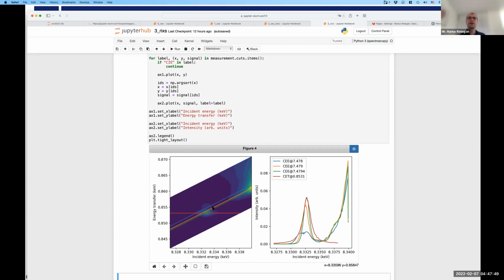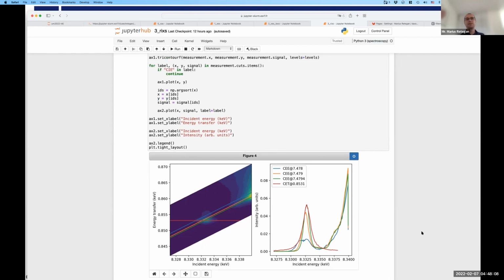If you measure a single cut and you see a spectrum like the blue one, you can come to a conclusion that this corresponds to a change in oxidation state, or an oxidation state that is different from the actual sample. And because most of the time you don't measure in transmission at ID26, for example, this is something to keep in mind.